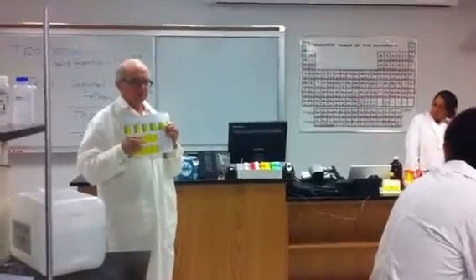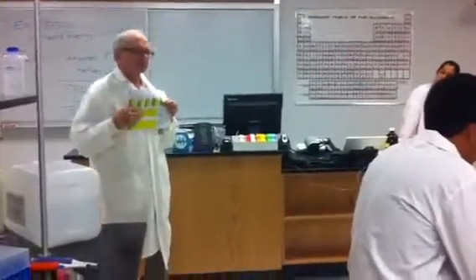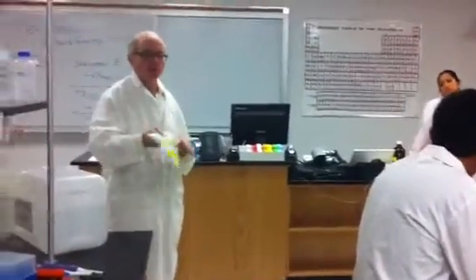So it's not uncommon for someone to say, oh look, this tube 8 got out of sequence with tube 9. Now what do we do? Answer, disqualify one of them, so that you get the right sequence back again. You just take one out of the run. Pull them out. That's fine. But report all the data to me. But before you do the graphics, then you say, well, we pulled one out. Fine. Perfectly legitimate. Whose is this? Oh, okay.